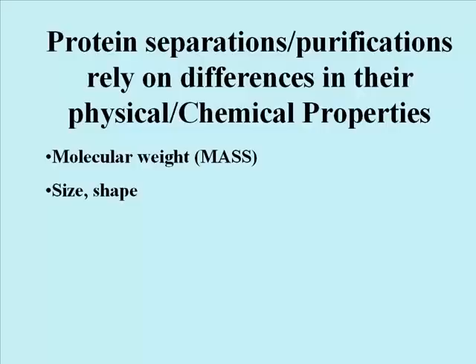And there are techniques that will selectively separate molecules based on this size difference, and yet other techniques that will separate them based on differences in mass. Proteins vary widely in the degree to which their surfaces are positively or negatively charged, so we can take advantage of those charge differences to separate proteins as well. Charge, by the way, is also dependent on the pH of the water in which the protein is dissolved.